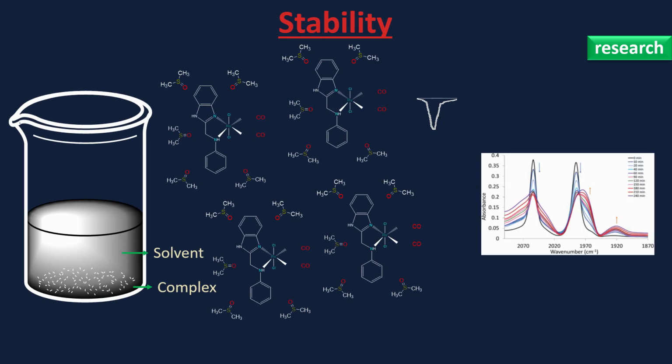Here the spectrum shows the dicarbonyl band intensities decrease gradually with time. The stability study can be against water, air, solvent, and others. It depends on your application.